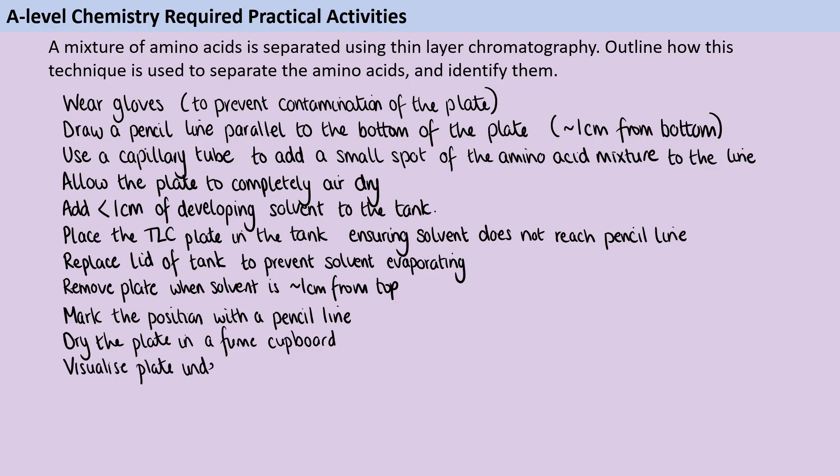Then you're going to visualize the plate and in order to do that you're going to need to have it under a UV lamp. While you're looking at it under the UV lamp you're going to mark the location of the spots using a pencil.